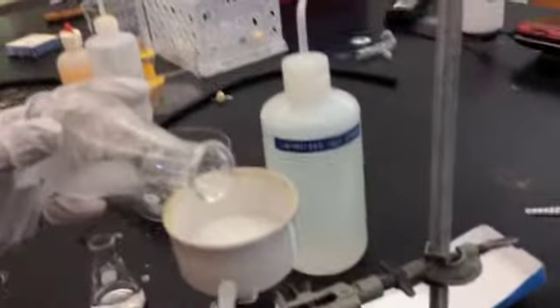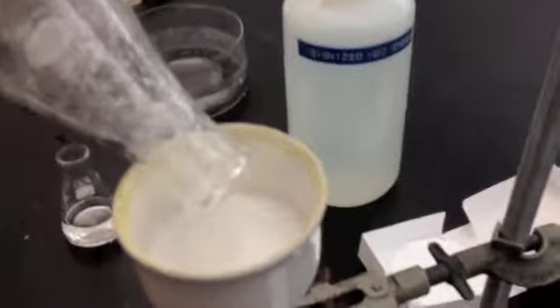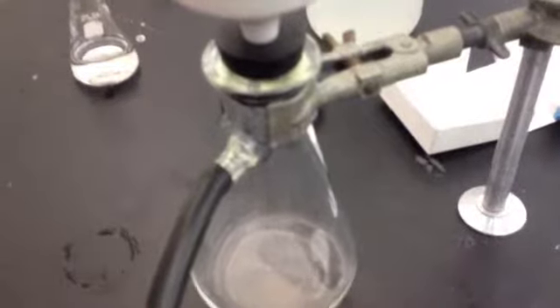So just pour it slowly. Let it collect on the filter paper. As you can see, it drained down. The solvent drained down into the flask.